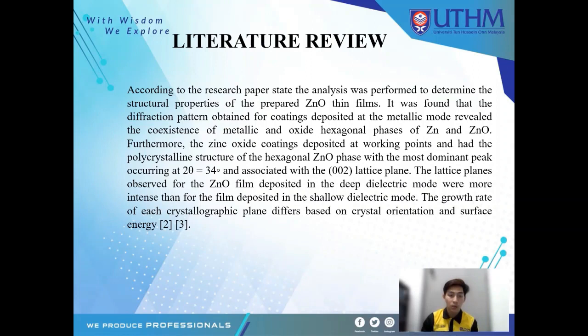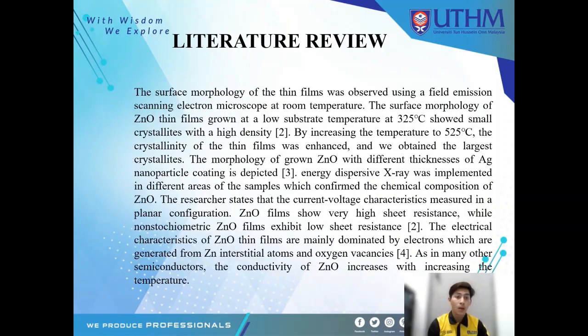And the associated 002 lattice plane, the lattice plane observed for the zinc oxide film deposited in the deep dielectric mode, was more intense than for the film deposited in the shallow dielectric mode. The growth rate of each crystallographic plane differs based on the crystal orientation and surface energy. Alright, next, the surface morphology of the thin film was observed using a field emission scanning electron microscope at room temperature.